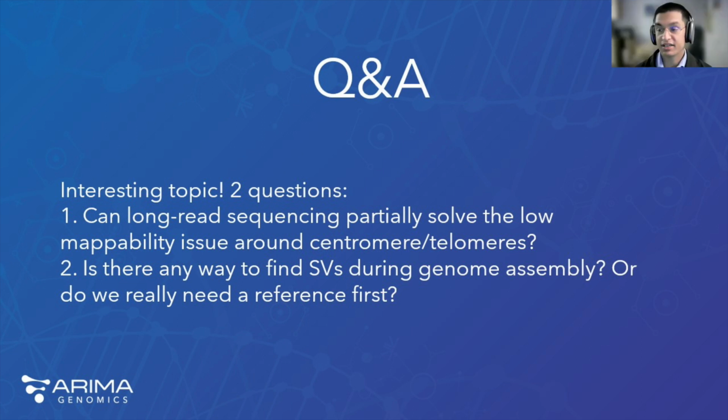I could take a part of that, Sophia, if you wanted to answer the first one or the second one. But I think for both of these, coupling Hi-C with long reads is definitely going to give you higher quality data sets. One of the advantages that we like to talk about for Hi-C data is, when you're working with FFPE or clinical samples, there's a huge advantage there, right? Because long read sequencing data is not able to work with that as well.